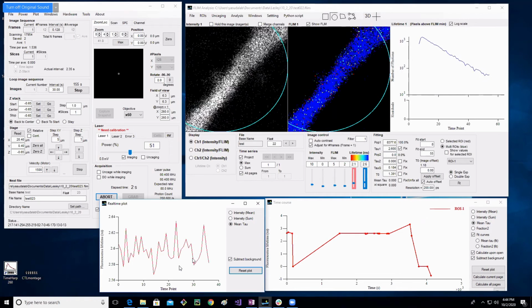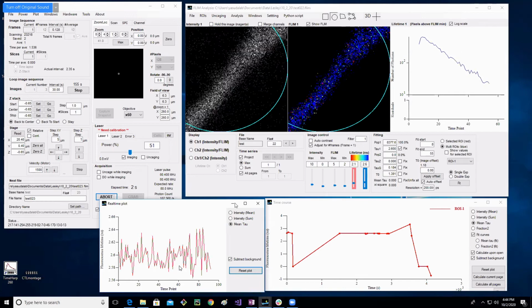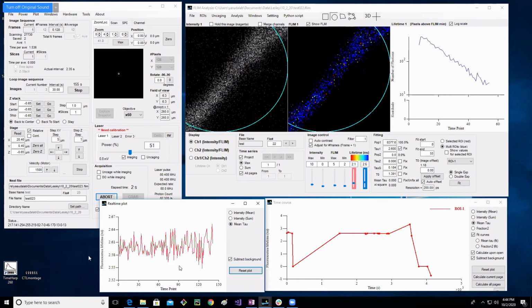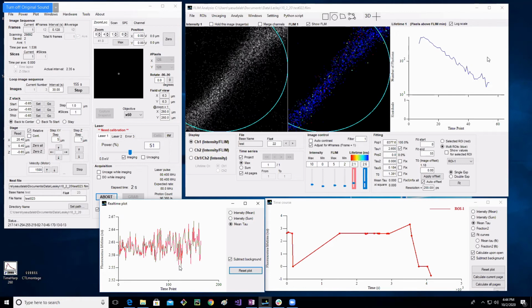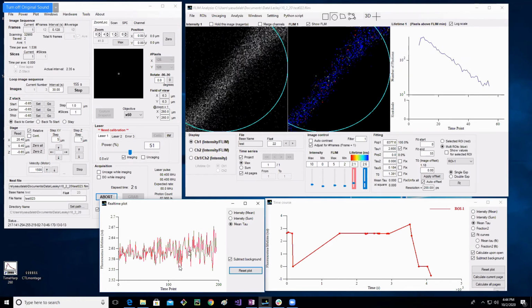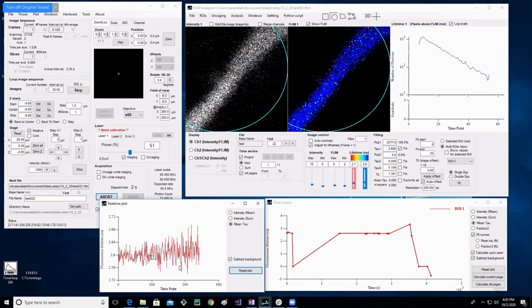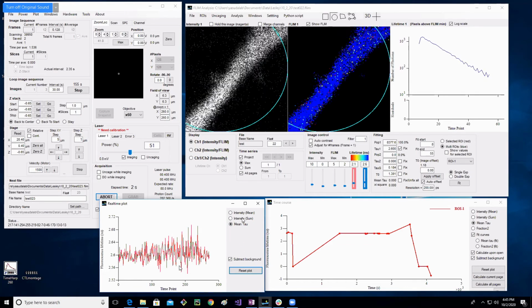What's cool is that if I go out of focus, my intensity will drop a lot, but you can see that lifetime is basically independent of intensity. It's basically steady at 2.6. It's getting noisier because now my FLIM curve is noisier and less accurate, with less total counts, right? See how much noisier it's getting? But it's still basically staying around 2.6. I'm back in focus, it gets less noisy. But it's cool.